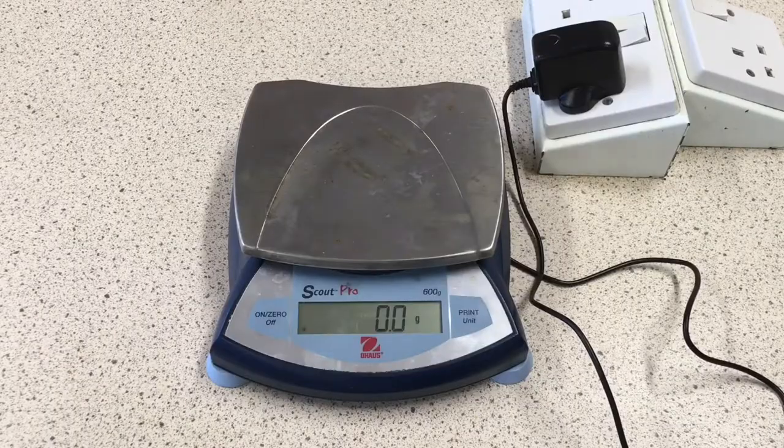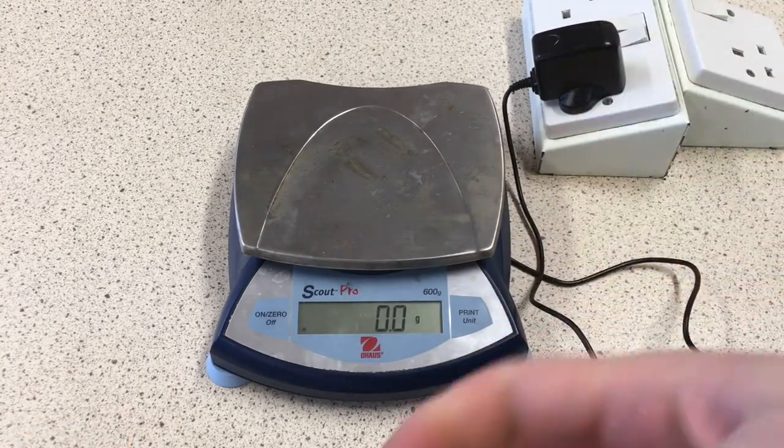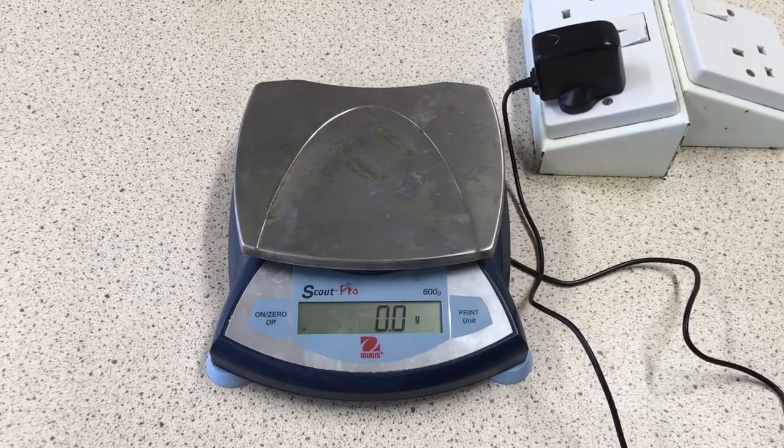The first thing we're going to do is weigh each crisp so we know precisely how many grams of food we are going to be burning. Remember to write down the numbers in the results table, otherwise it's all for nothing — so that's exactly what I'm going to do.